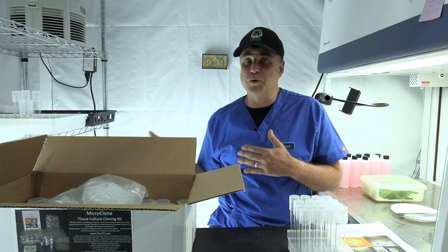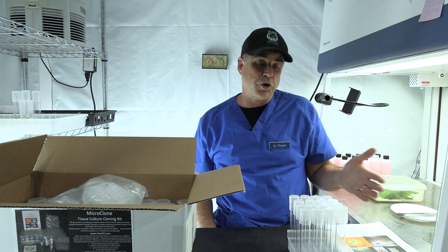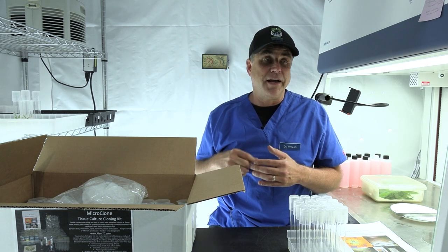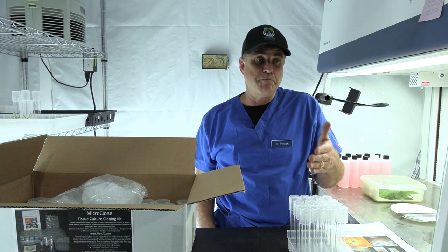We've also found two really interesting benefits that weren't even part of the kit when we started. We are eliminating viroids and systemic diseases that are always chasing the growing tips of the limbs. Every time a branch is growing, these diseases are in the vascular tissues and other stem tissues, always trying to chase the tip — sometimes just a hair close, other times several inches away. The plants we put into culture are started from pieces that may only be one inch tall, so we are simply taking material that has outgrown the viroid and other fungal diseases and making our new plants from it.